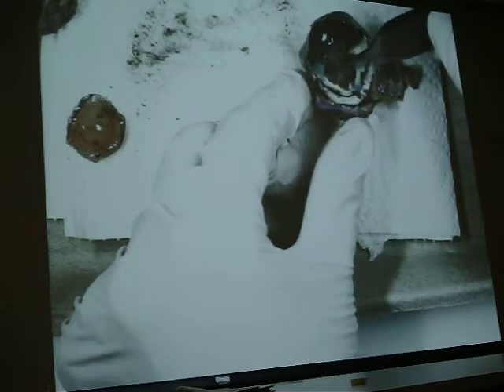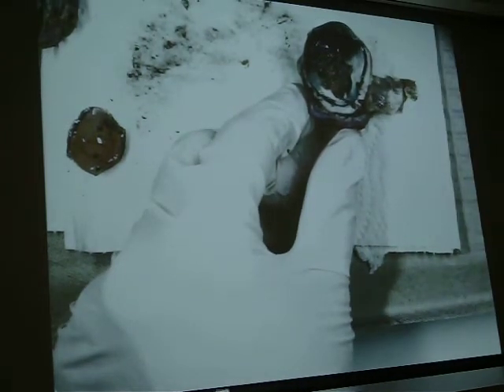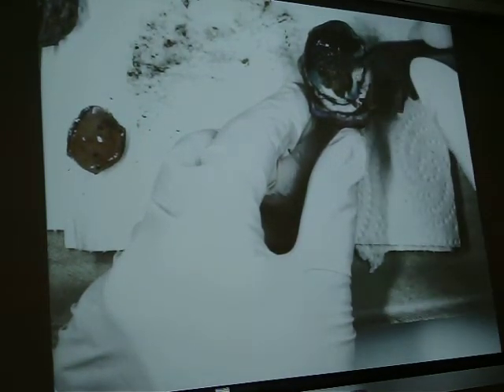This is a very fine, loose, curtly-type gauzy material. It used to cover everything back here, but it got semi-destroyed. Now I've got a little kind of flawed.